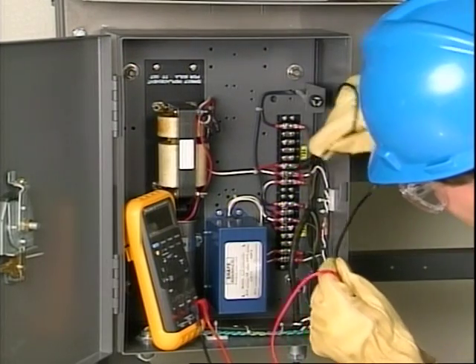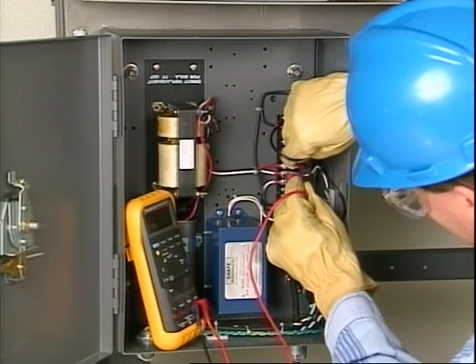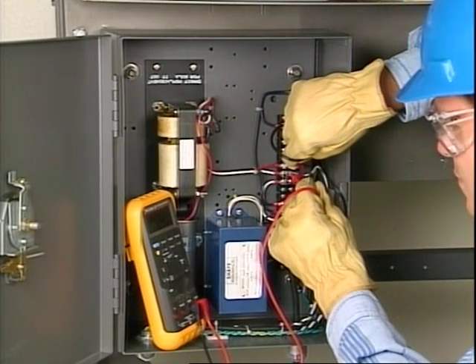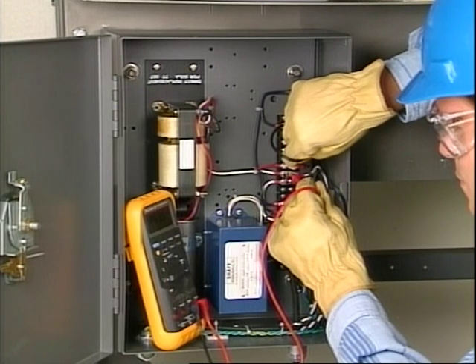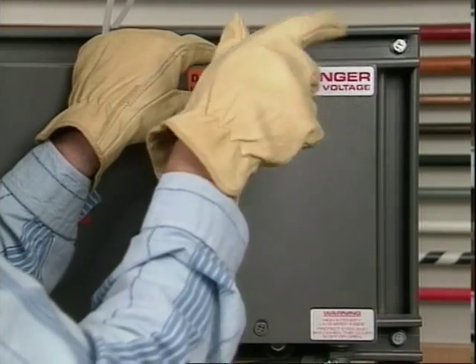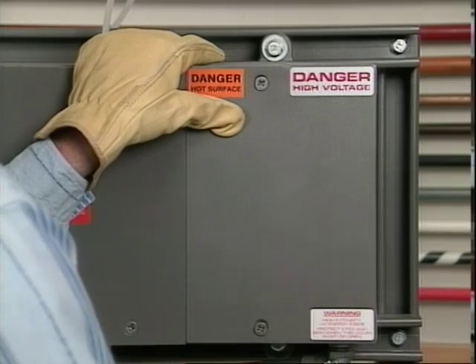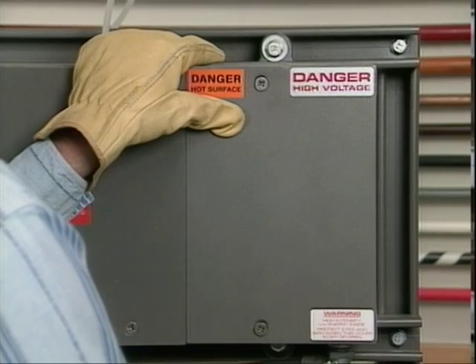Source failure may also be caused by a faulty power supply transformer or voltage regulator. Check for proper voltage at the power supply board. If the proper voltage is not present, replace the voltage regulator. If the power supply components are operating properly, then you'll need to de-energize the analyzer and replace the lamp.